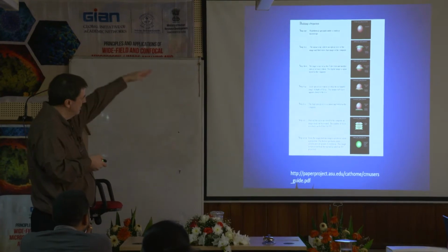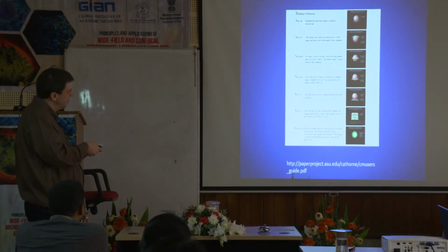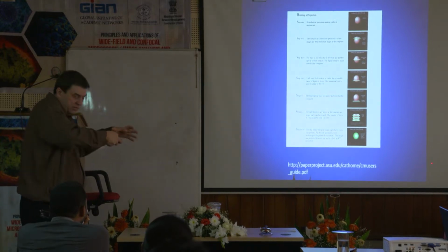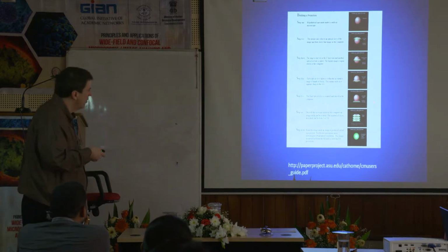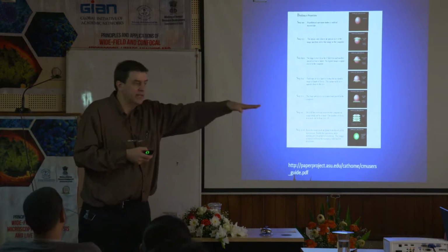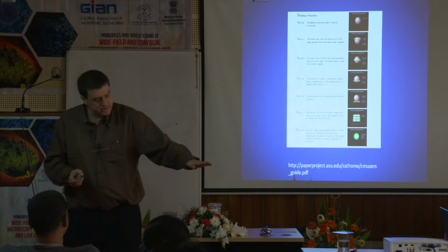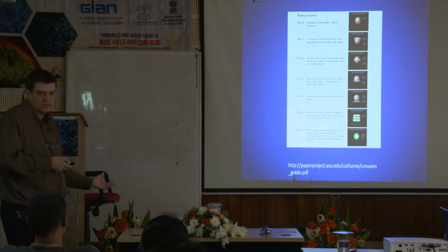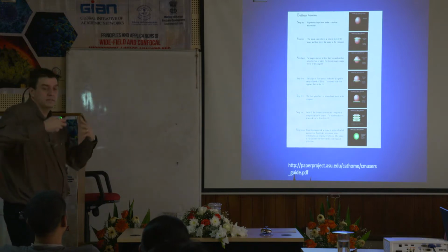So now what we have from that ball is a series of images that represent the ball. As you can see, the top image, the little circle's not as big because you're at the top of the ball. The middle ones are a little wider. You're in the middle of the ball. And then the bottom one, again, you're at the lower end of the ball. Well, you could do the exact same thing physically. You could take that microtome and physically cut that ball, put the pieces out in order, and you'd see how that structure is put together. But here, by using the confocal microscope, we're able to take that tissue apart optically, but not physically.